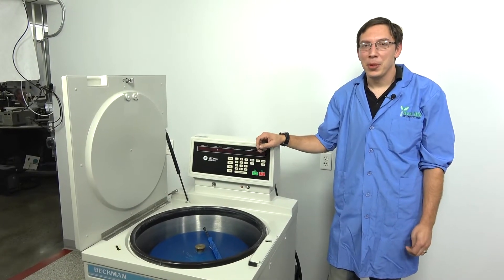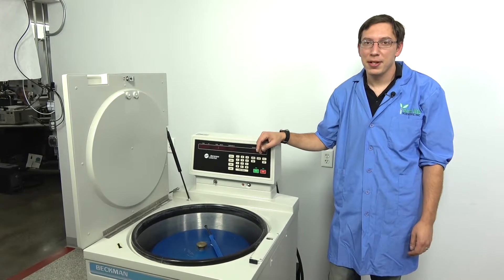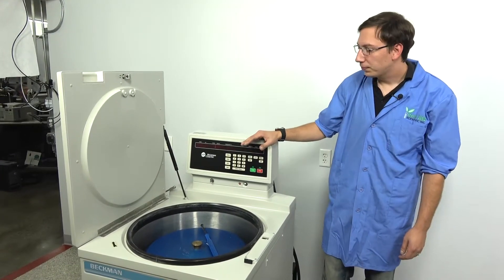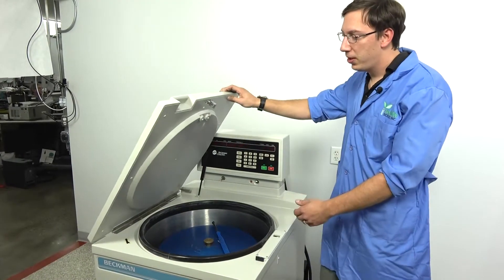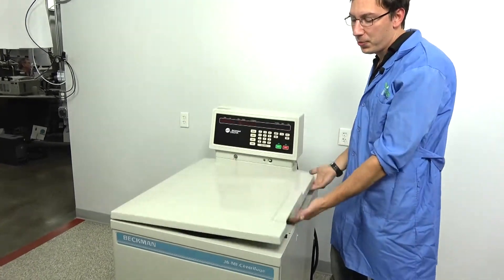Hi, my name is Bart. I'm from New Life Scientific and today we wanted to show you how to replace the springs on your J-series Beckman centrifuge. People oftentimes don't realize it, but your door can become very loose and this is a hazard to someone's hands.